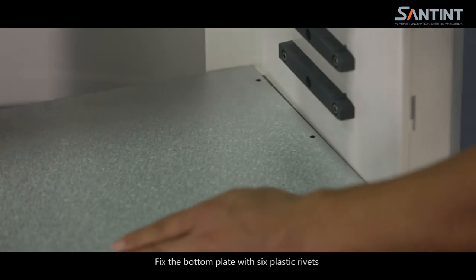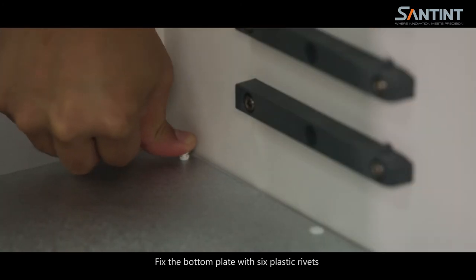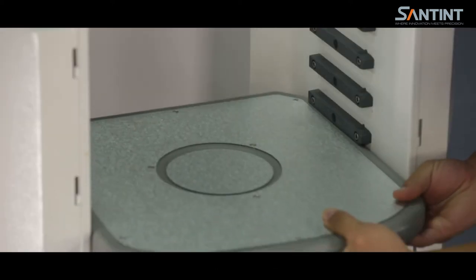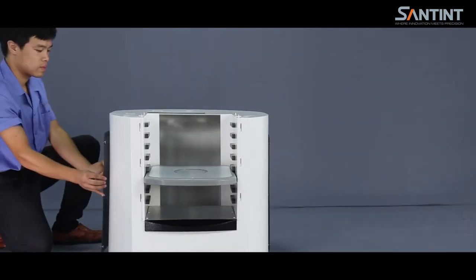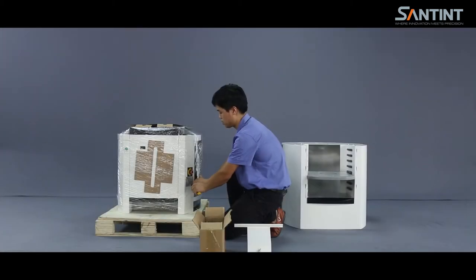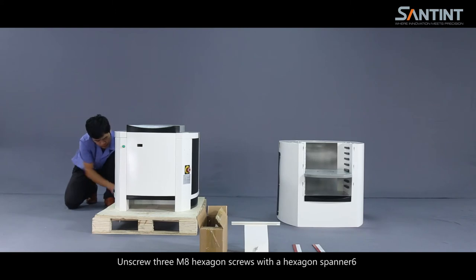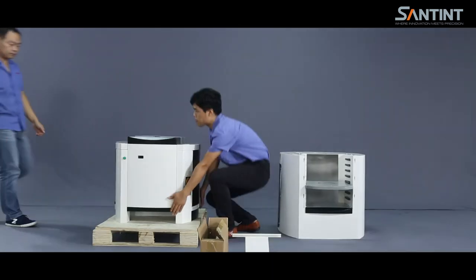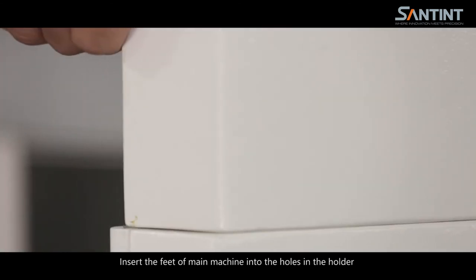Fix the bottom plate with six plastic rivets. Unpack the box of the main machine and assemble it. Unscrew three M8 hexagon screws with a hexagon spanner six. Insert the feet of the main machine into the holes in the holder.